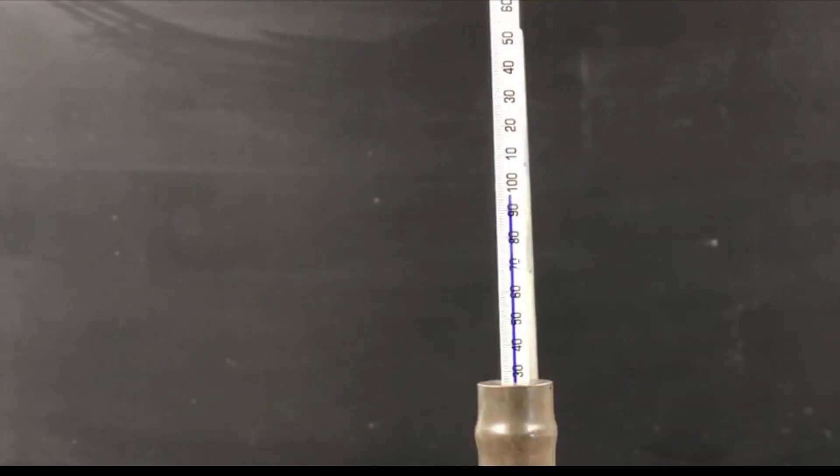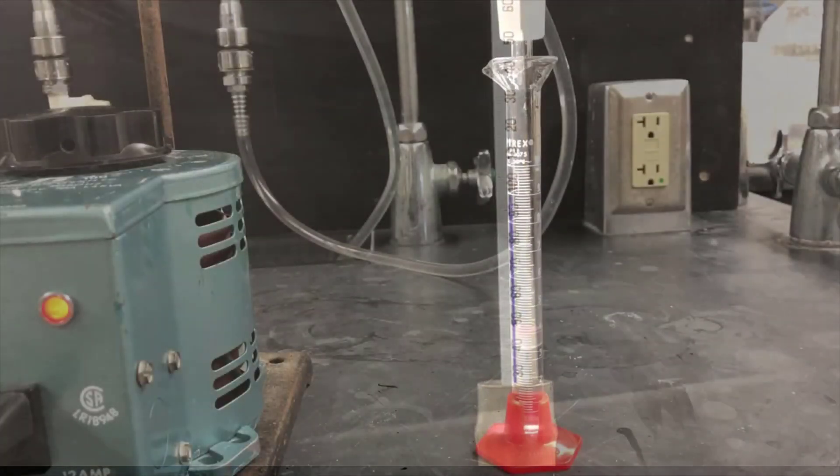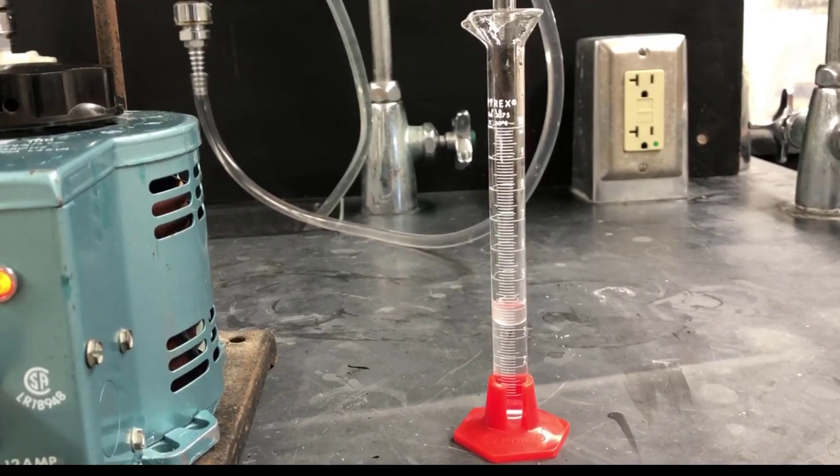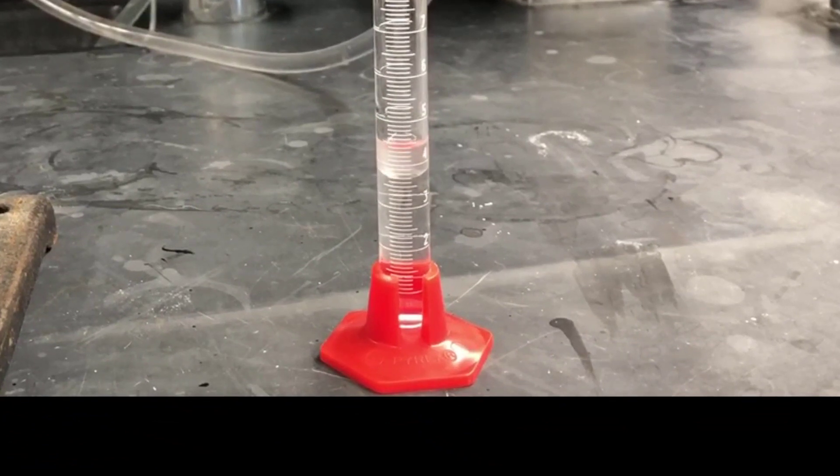Here you can see the temperature of the distilling vapor, which is just below 100 degrees Celsius. We'll collect about 4 or so milliliters of distillate. That will give us enough cyclohexanone product to work with. I'm zooming in here so you can see the distillate more clearly.